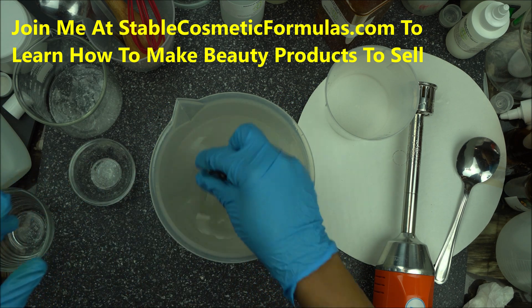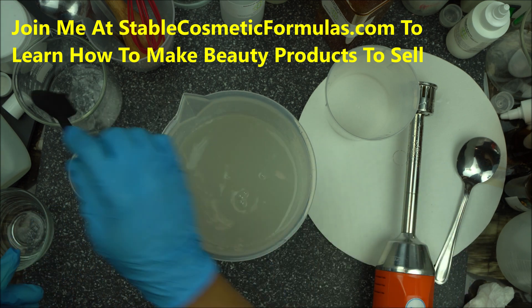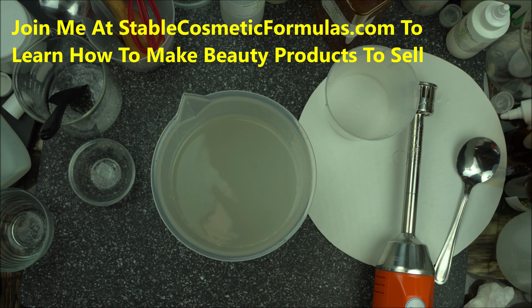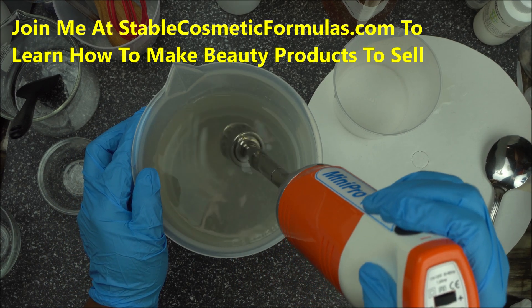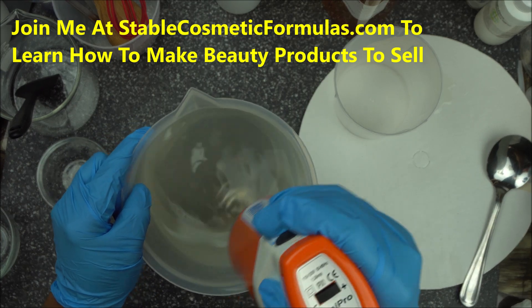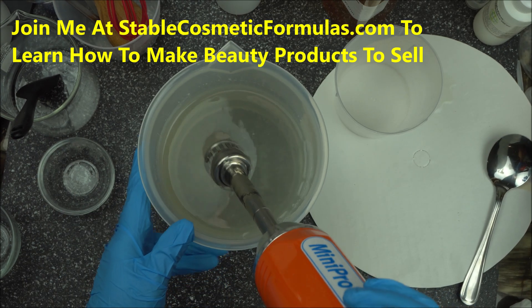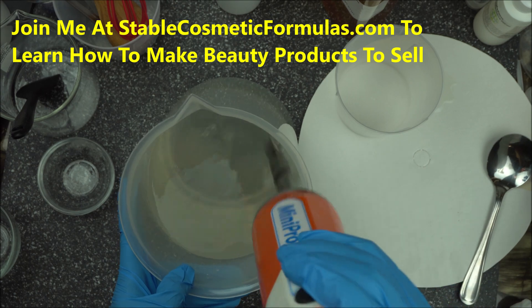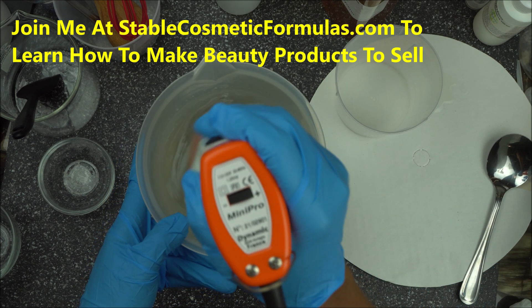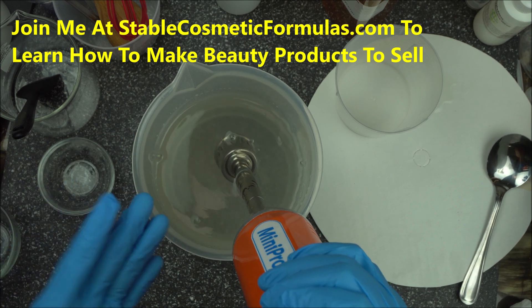We're going to come back every two to five minutes and do another blending. I'm going to keep this for five minutes, then start the video again — we'll do another blending until we get a solid gel. It's now after ten minutes, let's blend it again. This is how you know your gum has really blended — see how clear it is? Blend it a little bit, and when you notice it's not moving anymore, your gel has formed. When you put in your homogenizer and it's no longer moving, the job of the homogenizer is done.